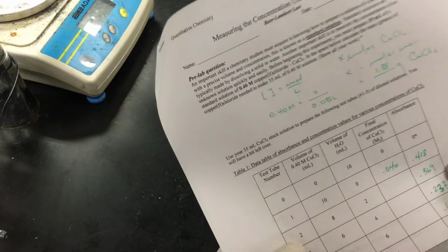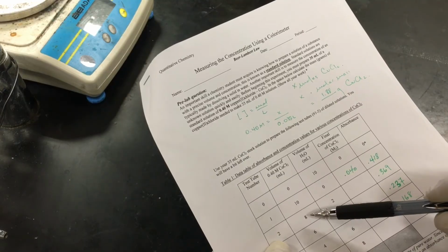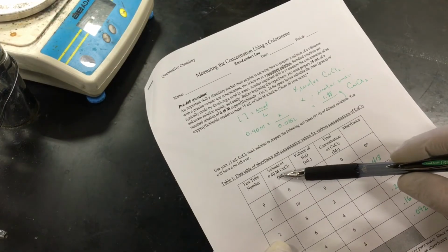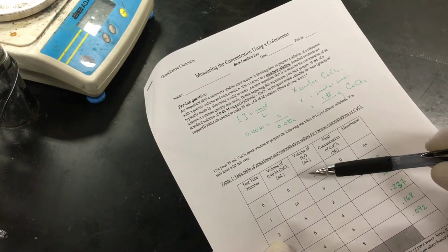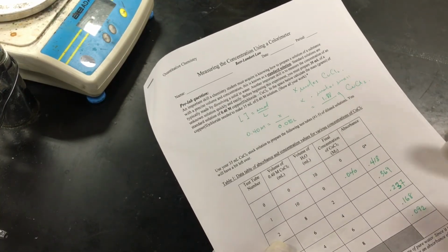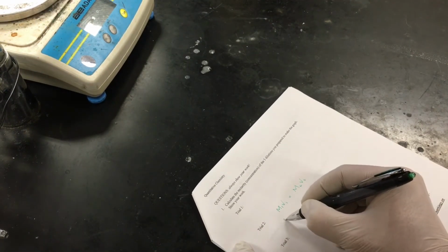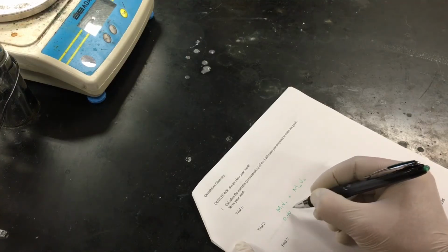So for test tube number 2, before we added the water, we had 8 milliliters of 0.4 molar copper chloride. So this is the situation before we add the water. Concentration 1, 0.40 molar.